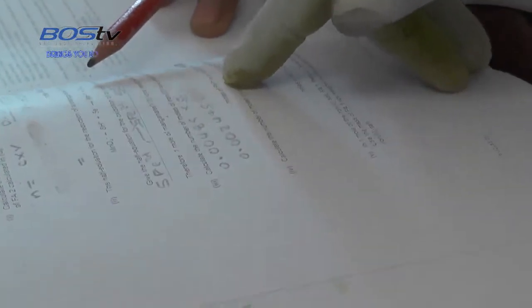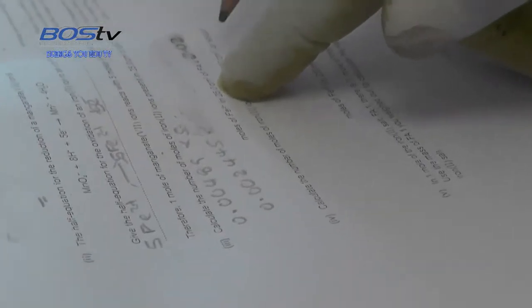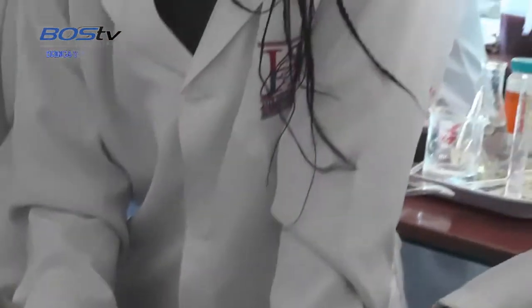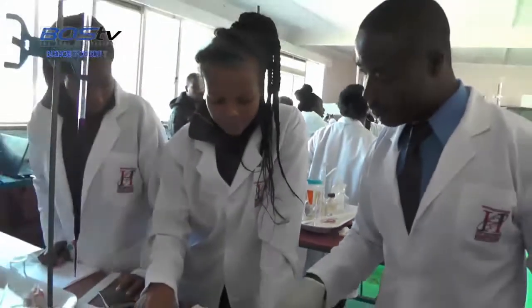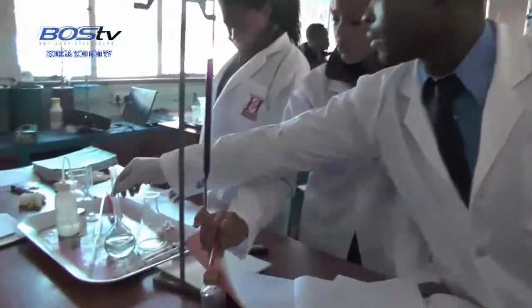Here, the number of moles of iron 2 plus were in 25 cubic centimeters. But you did not use 25. You use the 25. It's the one that you pipetted. You pipetted how much? Using the pipette. 25 is this one. Now, here you multiply by 10 because that whole iron was dissolved in this 250.